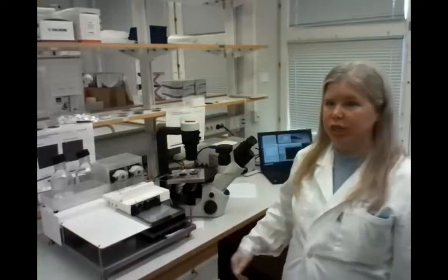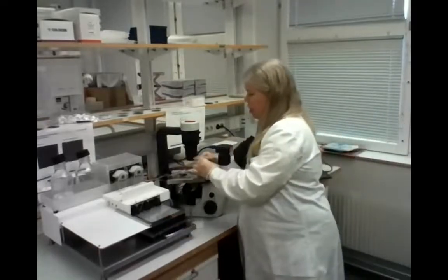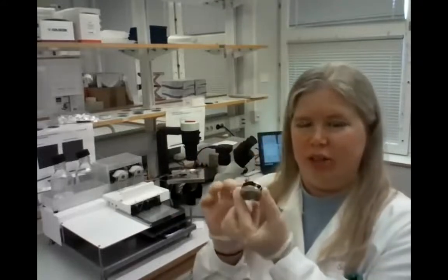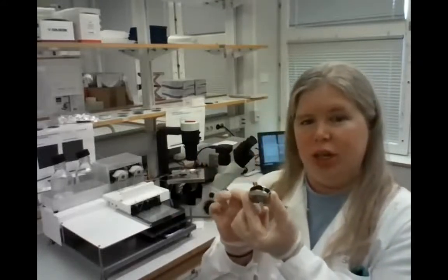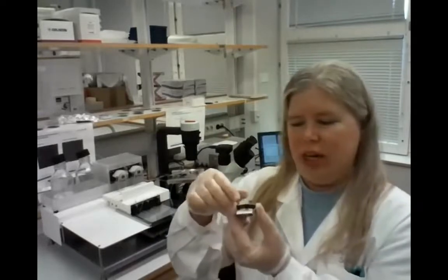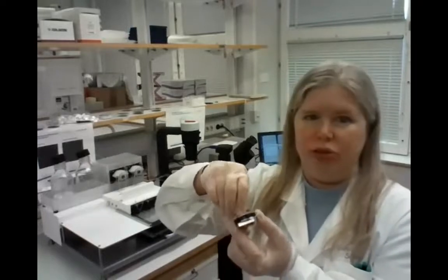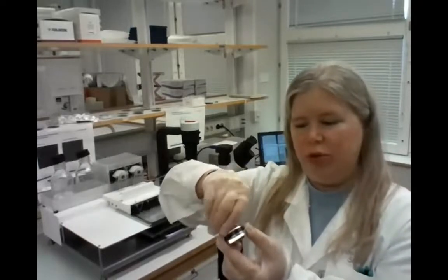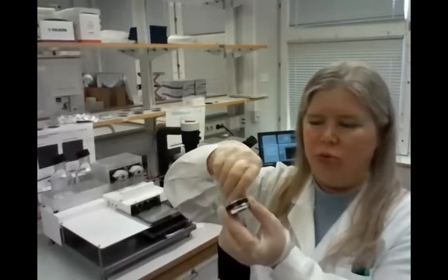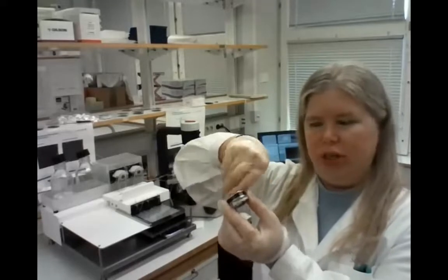You also save this dissolution chamber. As I said before, the mucus simulant got in contact with the particles on the glass cover slip, and this mucus simulant is a bit sticky, so the glass cover slip is normally adhered to the dissolution chamber via the mucus. So you will get out a package here with undissolved and unabsorbed substance.